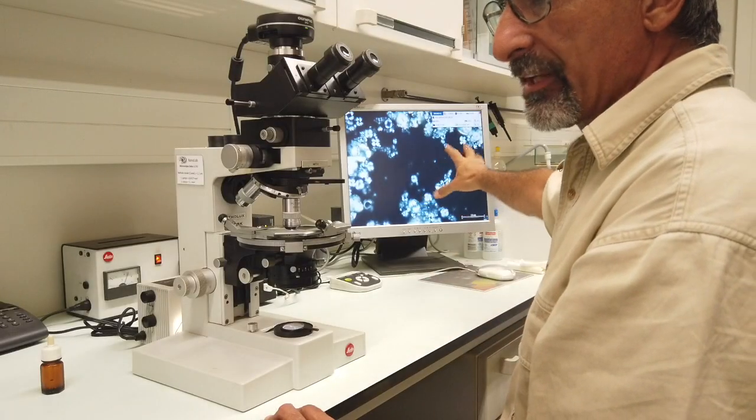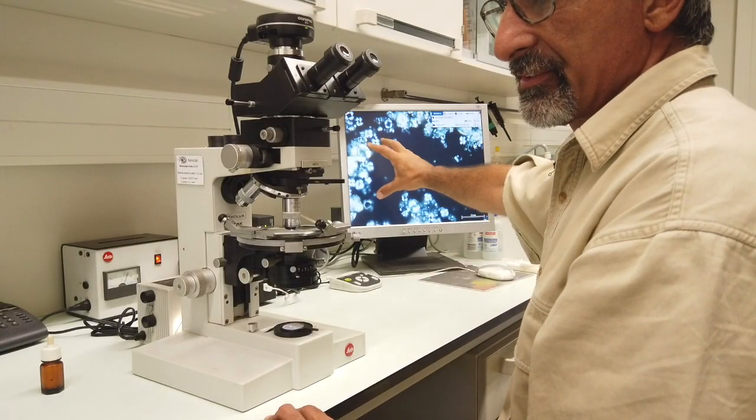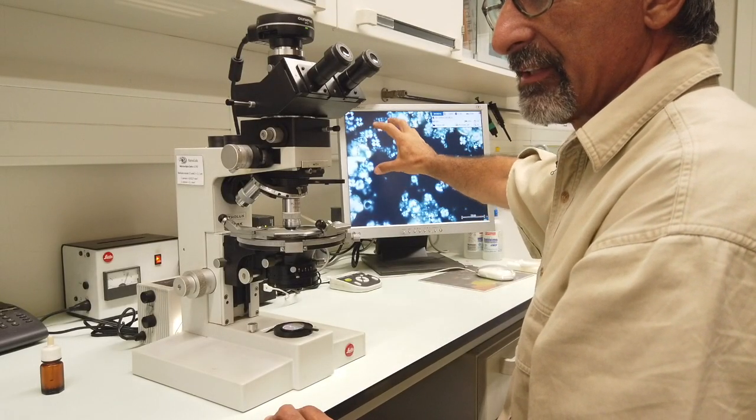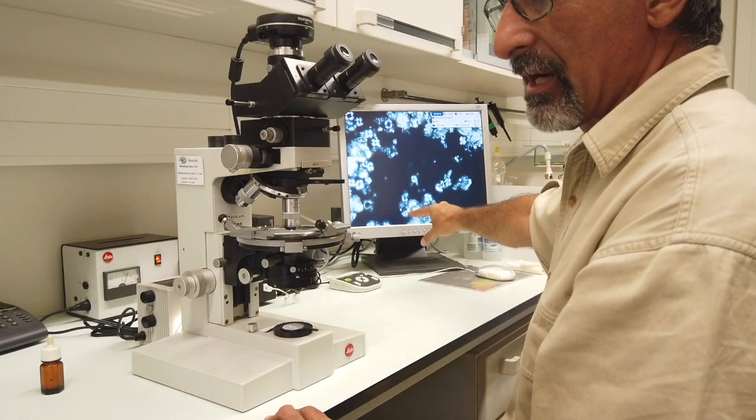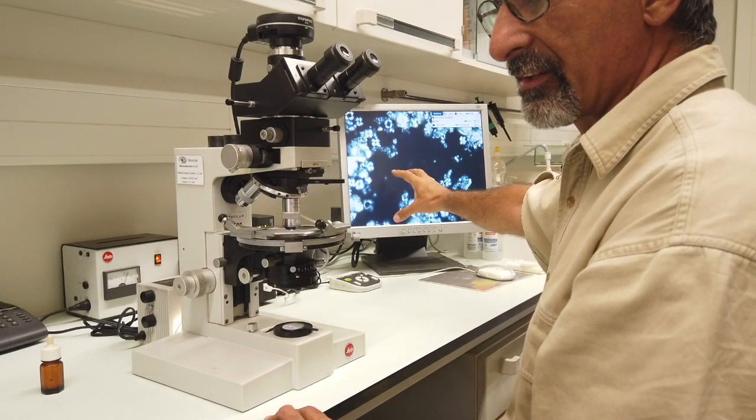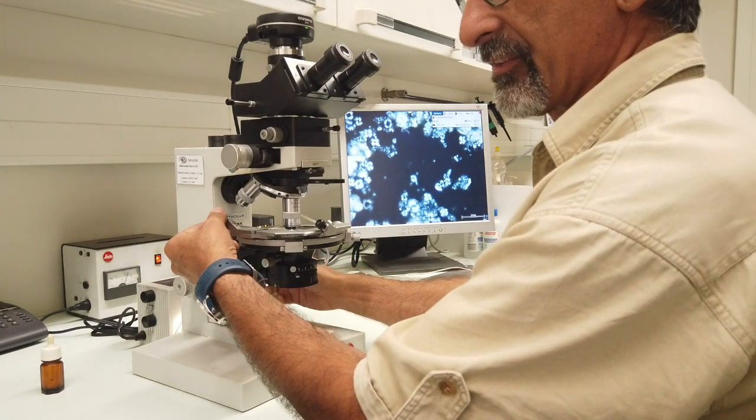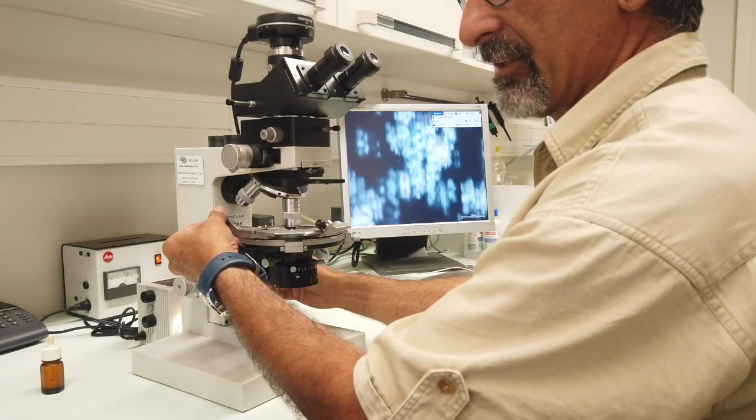So, now we can see all these structures, they are made of calcite, each one of them are a single calcareous nanofossil, and we can see them all over the place.